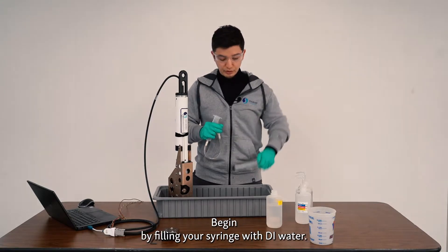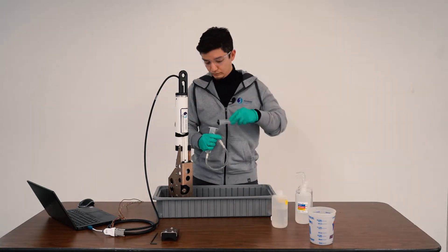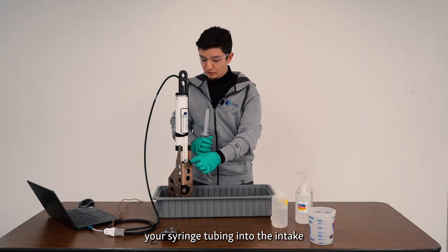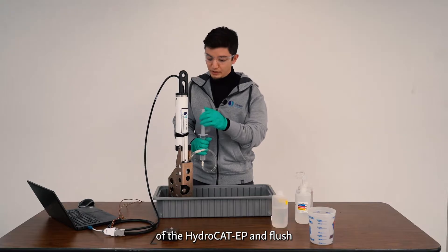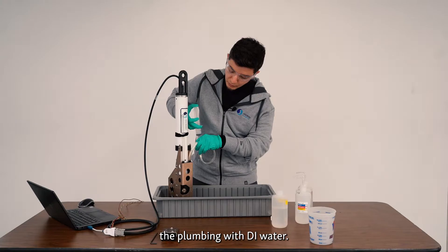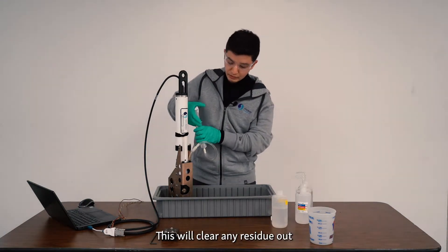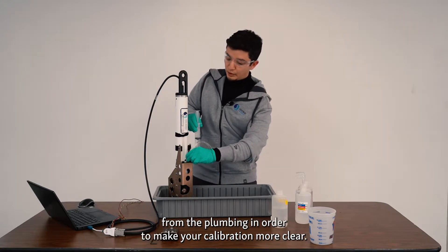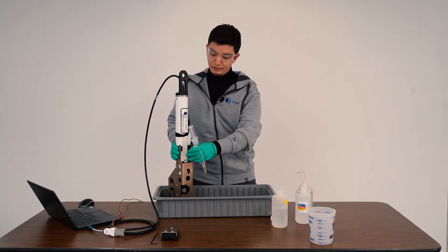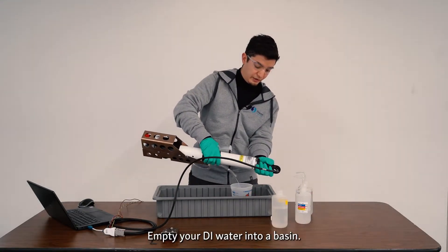Begin by filling your syringe with DI water. Next, attach your syringe tubing into the intake of the HydroCAT-EP and flush the plumbing with DI water. This will clear any residue out from the plumbing in order to make your calibration more accurate. Empty your DI water into a basin.